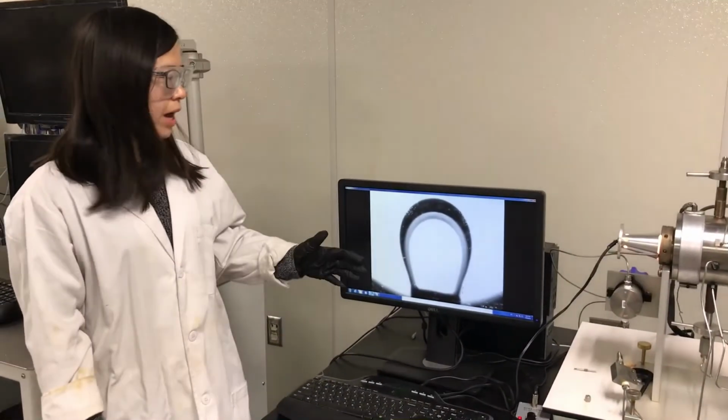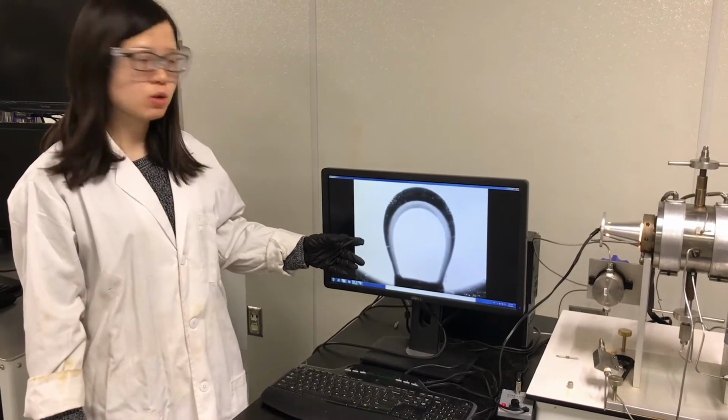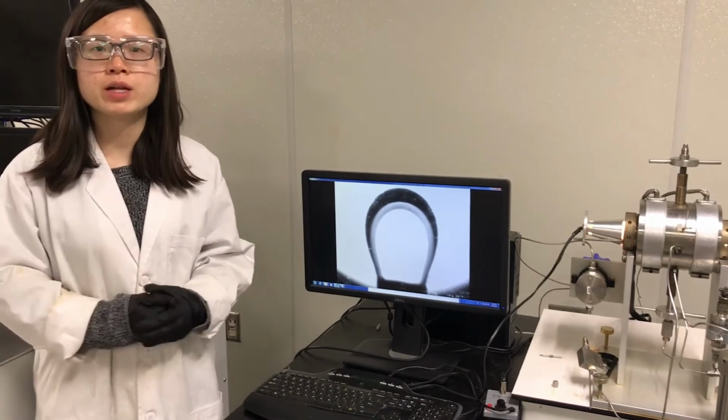Okay, we have finished loading our two liquids. The external phase is the water, and the internal phase is the oil droplet. And now we are ready to do the measurement.